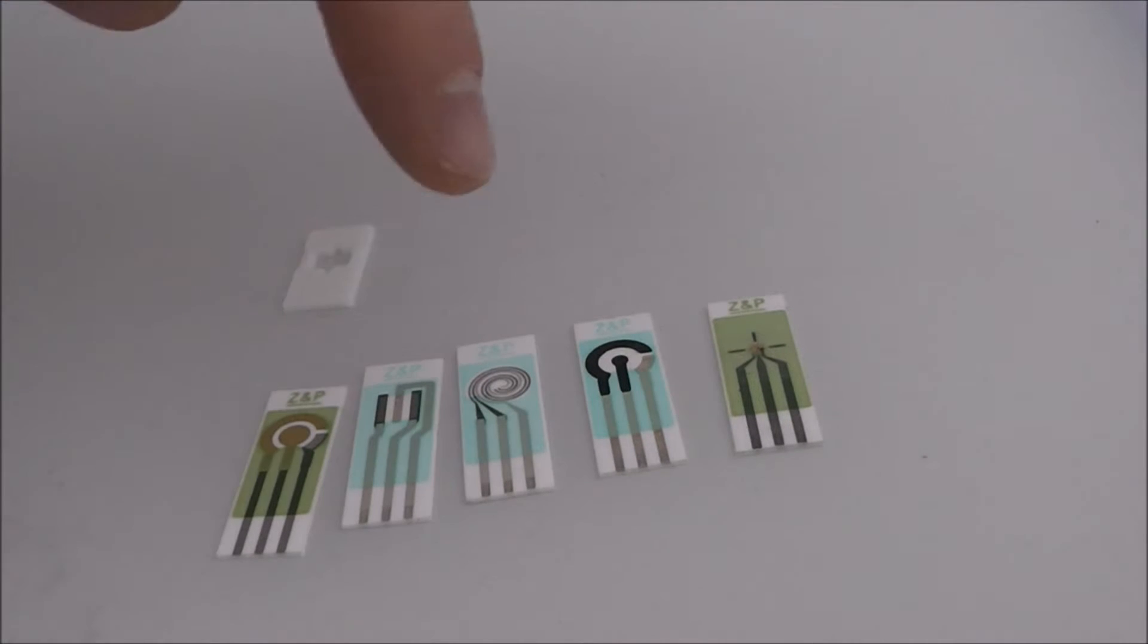So the first way we can add value is actually printing down the recognition system on there, be it an antibody, be it an ionophore, be it an enzyme. That will increase the functionality of these electrode systems by making them specific to the analyte of interest. That's the first step.